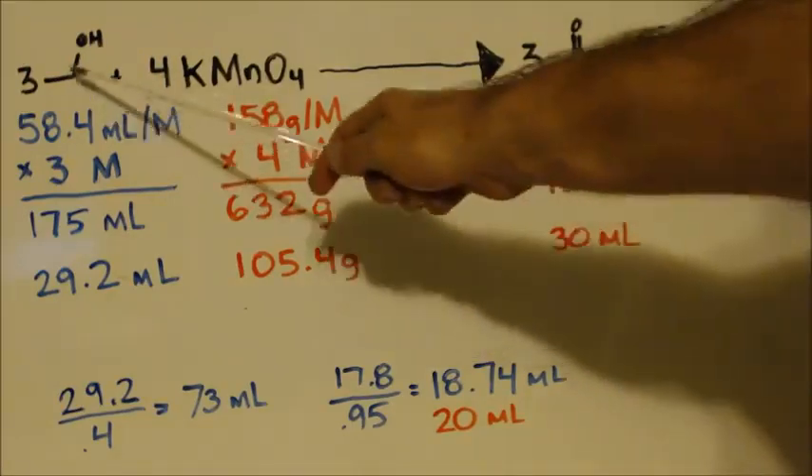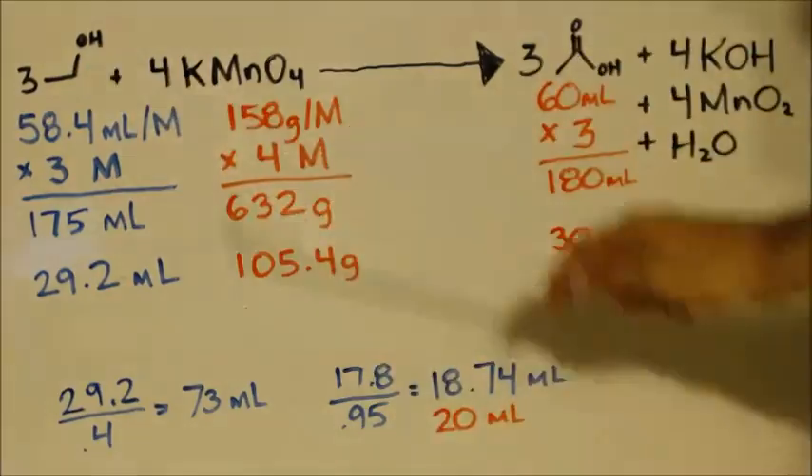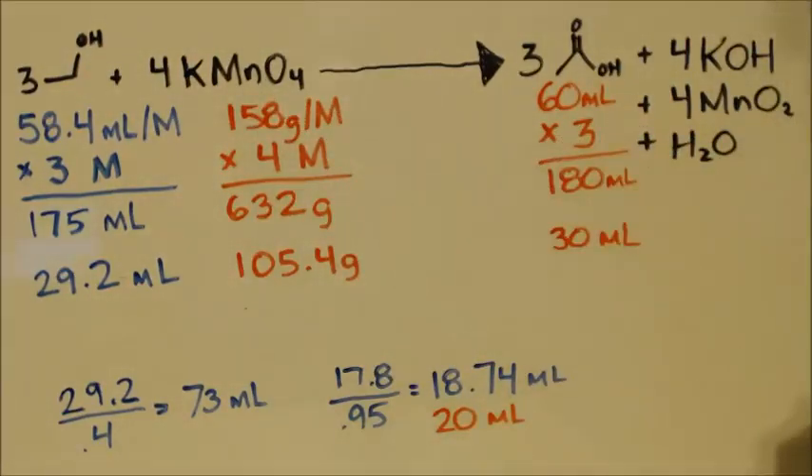We're going to take the ethanol — vodka — and potassium permanganate, and it should come out with acetic acid. The MnO2 byproduct we can filter out.